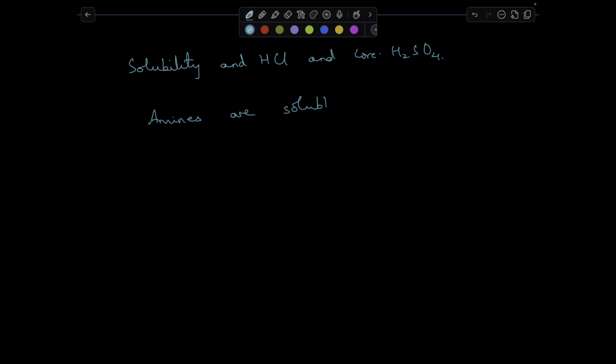Okay, now let's see about the solubility in HCl and concentrated sulfuric acid. Amines, being basic, are soluble in HCl.